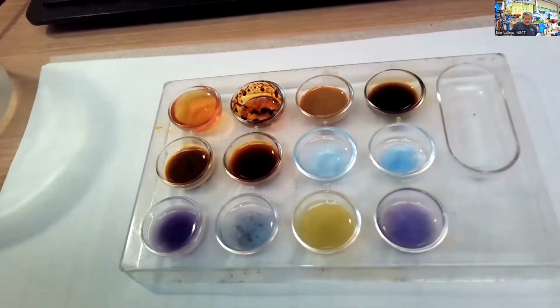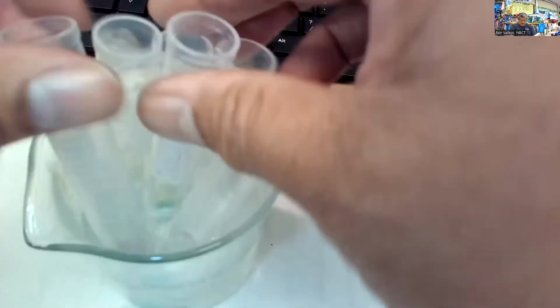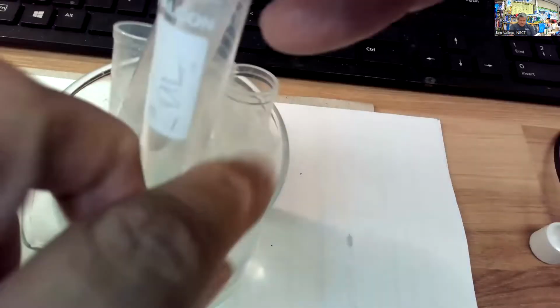Okay. And then going back one more time to the Benedict's test, what you have over here is, let's see, here's number 2 and 3. Here's number 1. You see 1, 2, and 3. You do not see a yellow, orange, or red color.